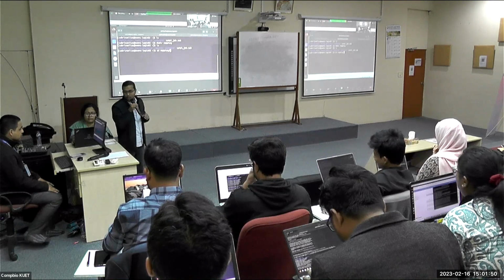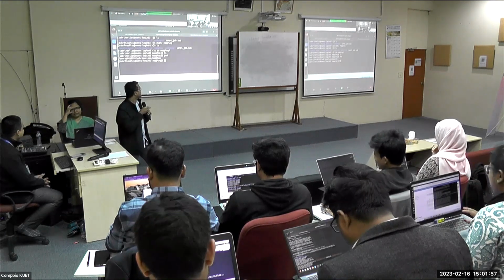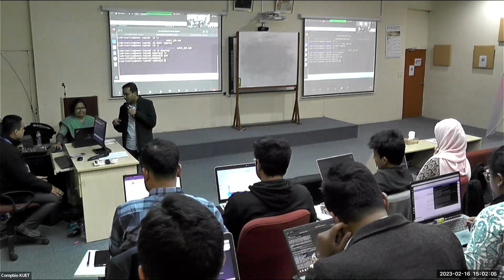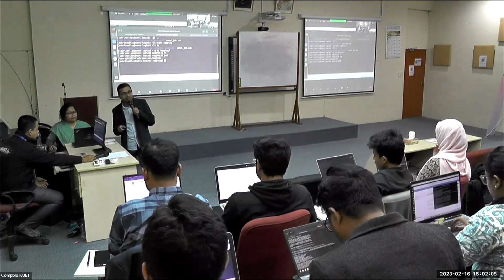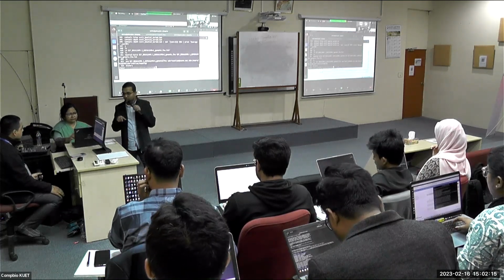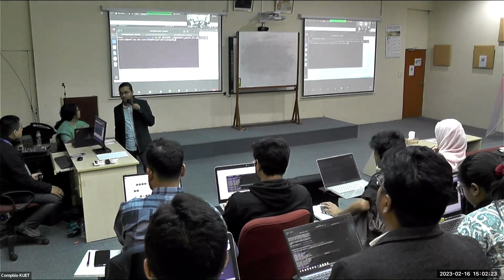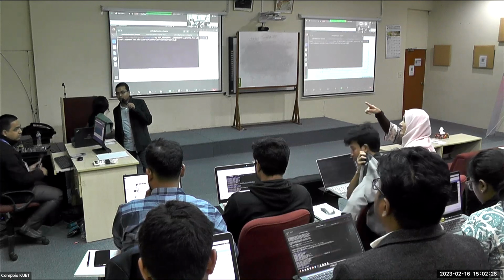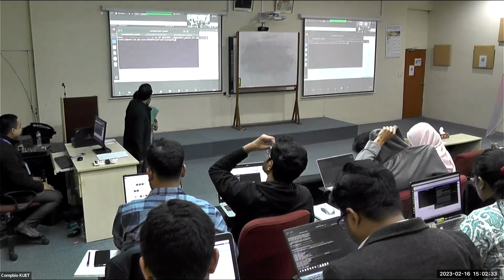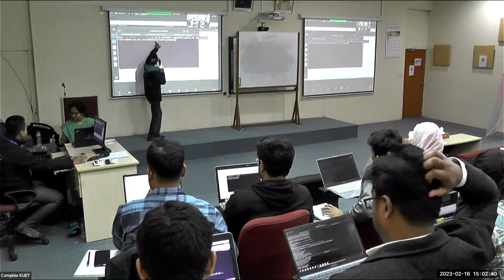Okay. Great. So you have to upload the FNA file to this directory, and the command is from your computer, from your personal computer, that is your laptop. So in your laptop, type this one. Yeah, your user ID. So here you should have written your username.